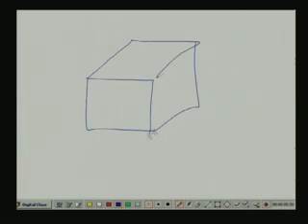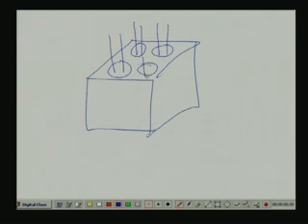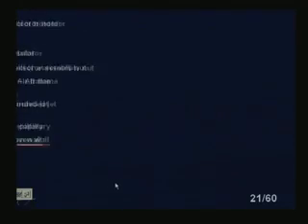So, what we have is a block with 4 detectors. I can have 2 detectors and I can have 4 detectors also. It is coming like this one, right. Okay, let us go back.